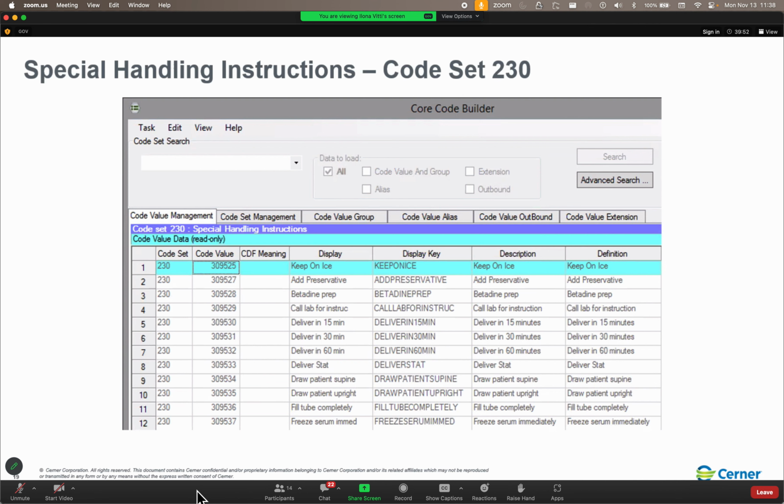Okay? If you decide that you want to run through all of the build again, maybe with a different orderable on your own, after class, one, feel free to do so. This environment is yours till 4:30 on Thursday. But two, if you do that, any of the build that you do outside of class should have a different identifier on it, so that we can easily tell what you did in class versus what you did out of class.